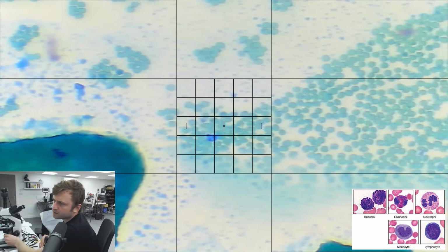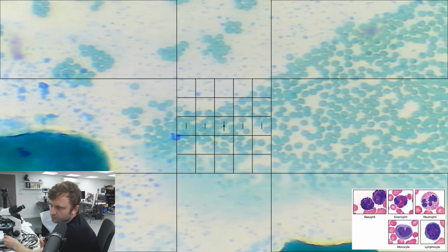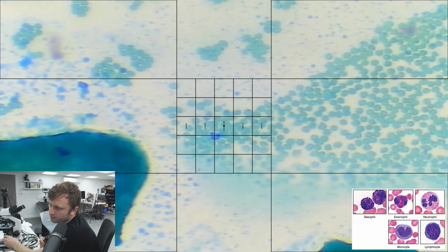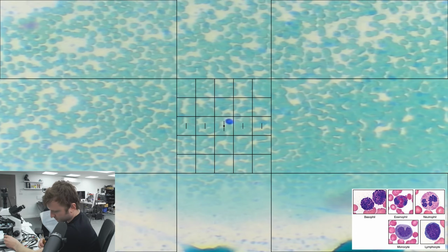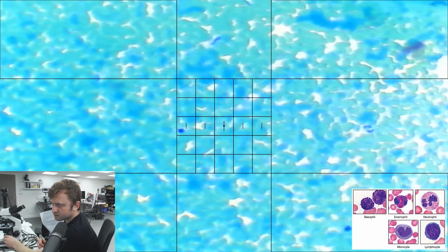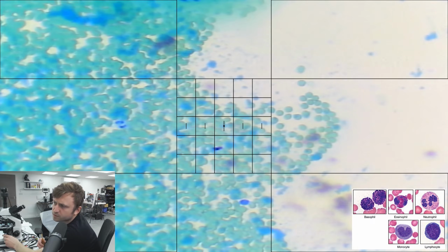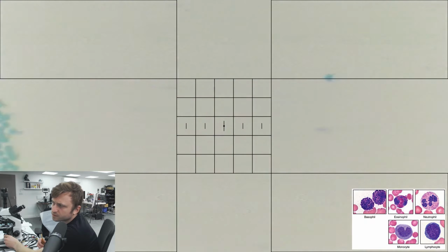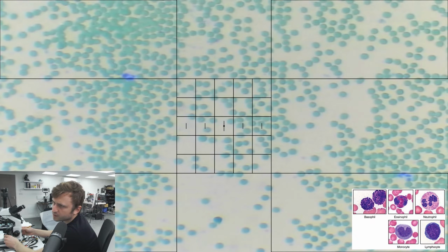All right, let's start. So I'm going to go ahead and say that first one in the grid there is a neutrophil, just given the variable blueness of it. Going to mark that as 1. Move along. That's a lymphocyte, I'm pretty sure. Continue. This clump is too strong. That's a lymphocyte. That is a neutrophil. Pretty sure. I don't think that dark one is. It might be a platelet. Moving on. Let's just refocus. Nothing here. I'm not going to count that one above.